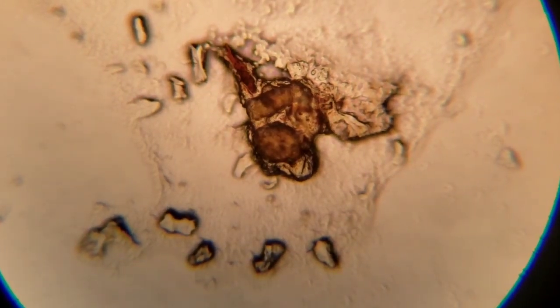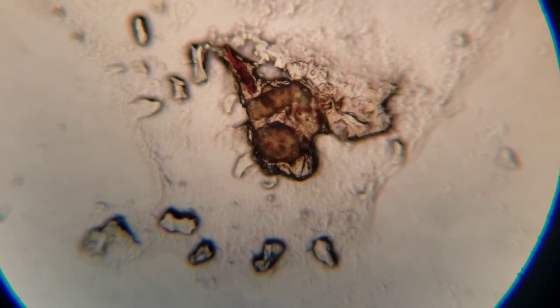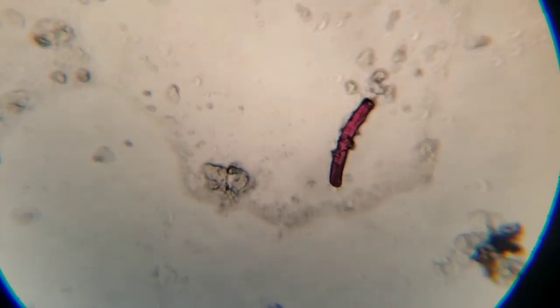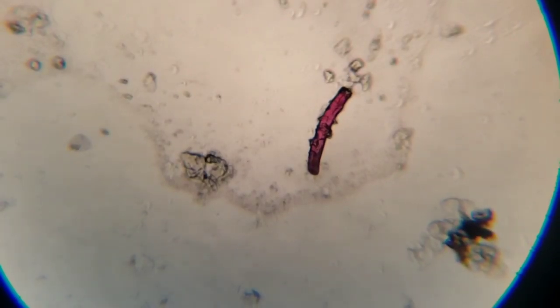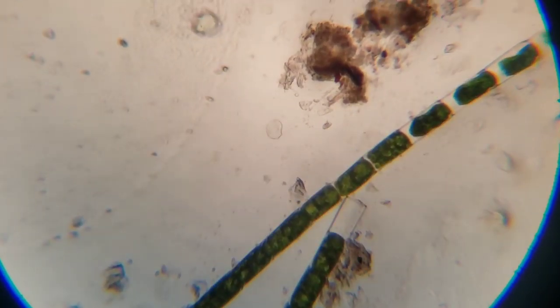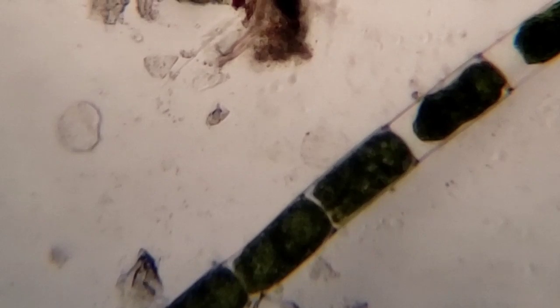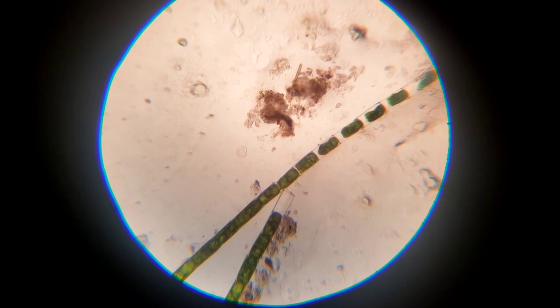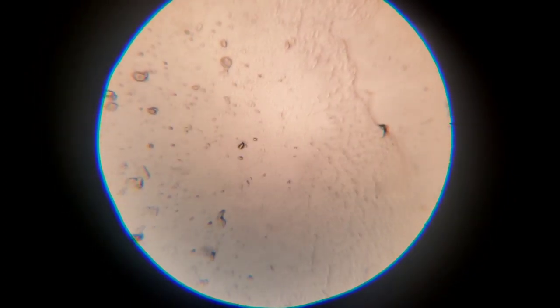Here we have a little bit of leftover food — this is probably cells of fish flake or some sort of crustacean. You can see more cell walls of algae that's either broken down or died. Here we have some red algae — pretty cool, huh? You can see that bright purple color, really pretty. But I think this is so neat to see. We see the little tiny critters, whatever they are — they're definitely on the microscopic level rather than macroscopic, able to be seen with the eyes.